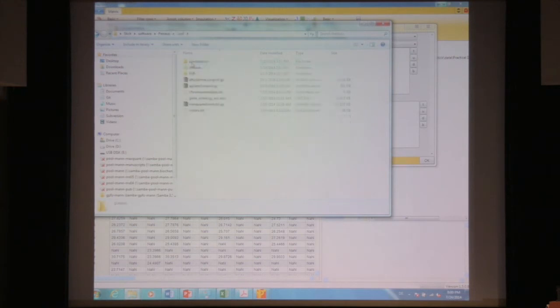Perseus, conf, annotations. So place it in there. And while we're there, we also want, off the USB stick, again under annotations, inside this PSP folder, which stands for PhosphoSitePlus, the kinase substrate dataset and the phosphorylation site dataset.